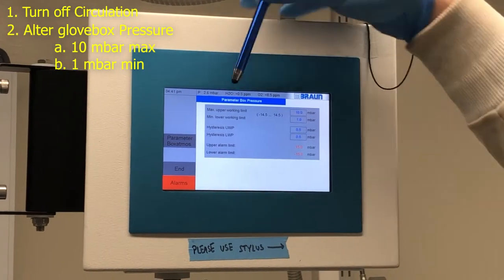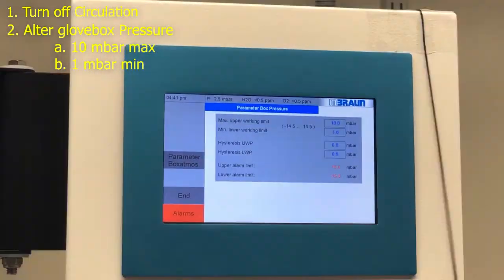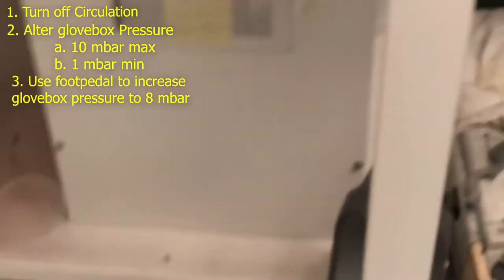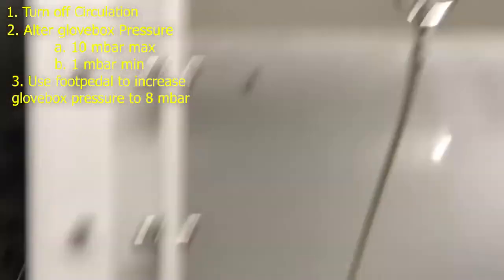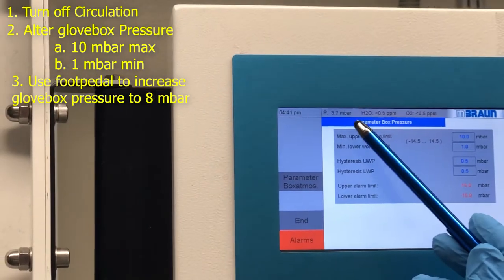Okay, and what you want is up here it says 2.6. You can use the pedal that's down here. If you just slightly step on it, you can go back up here. You just want to keep doing that until this says 8.